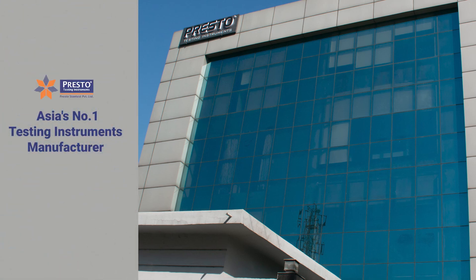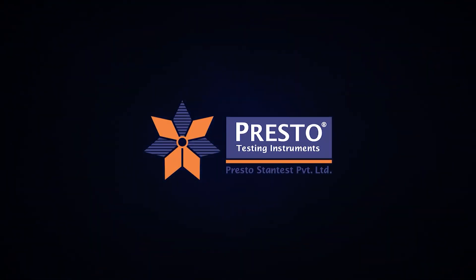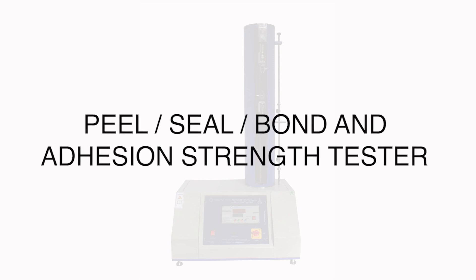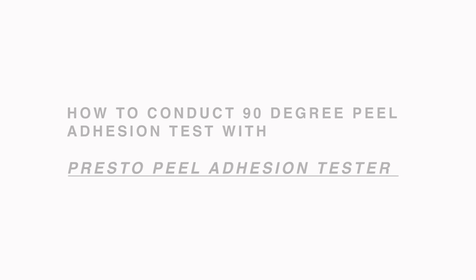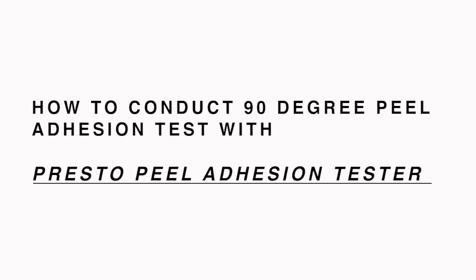Asia's Number 1 Testing Instruments Manufacturer presents the Peel Seal Bond and Adhesion Strength Tester. This video demonstrates how to conduct a 90 Degree Peel Adhesion Test with the Presto Peel Adhesion Tester.